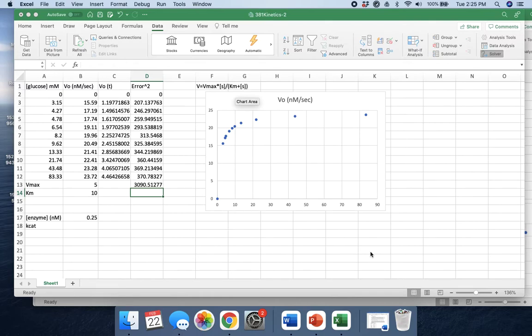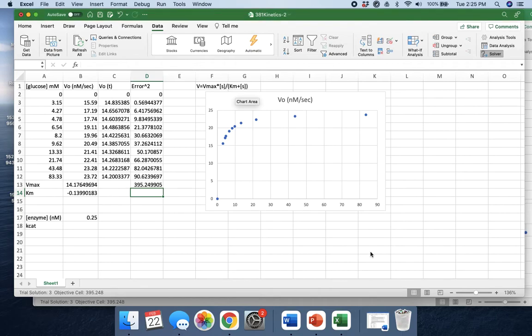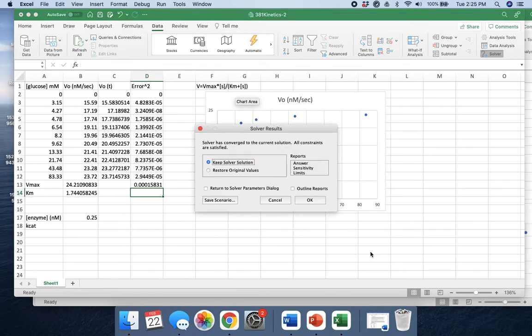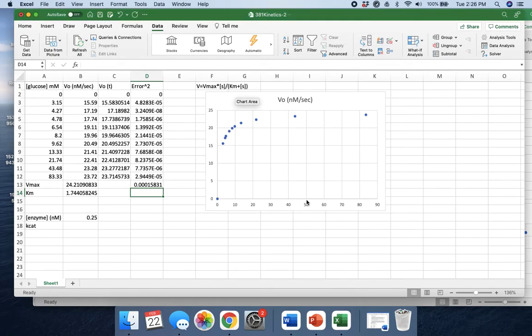We just give it a second to think about that. Give it another second. Those numbers look good, and it's done solving. So we click okay, keep solver solution.